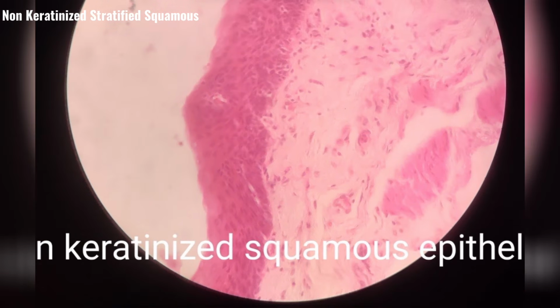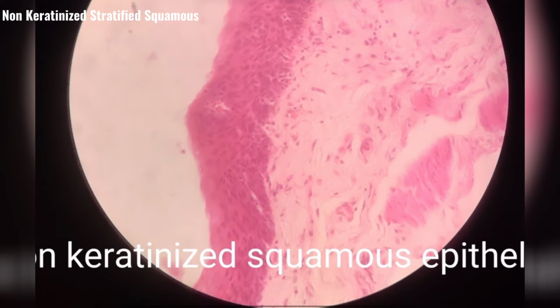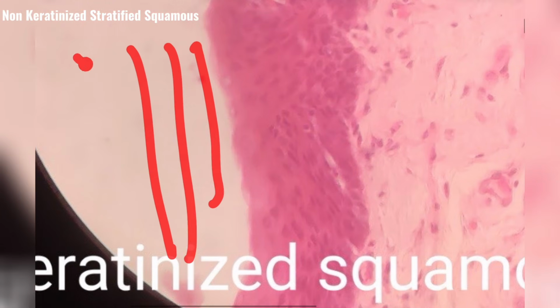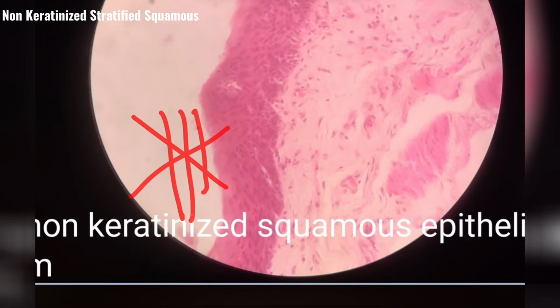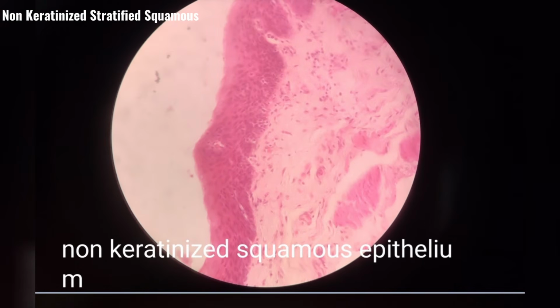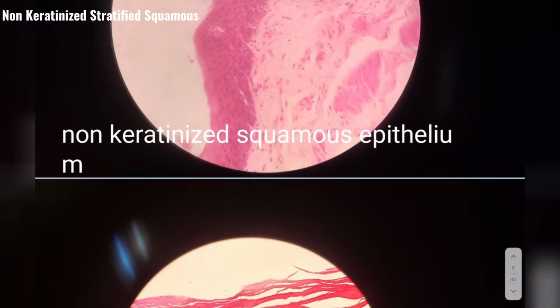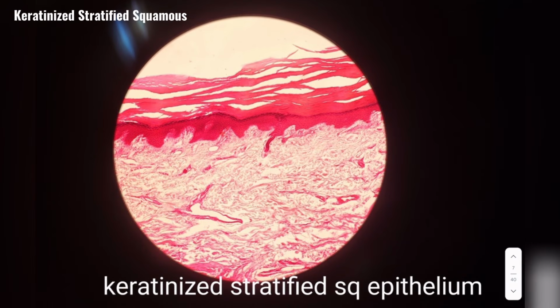But then there's one more thing to observe: the presence or absence of keratin. You can see that at the top, keratin is not present. So it is non-keratinized stratified squamous epithelium. Okay, let's say keratin was present. It would look something like this.